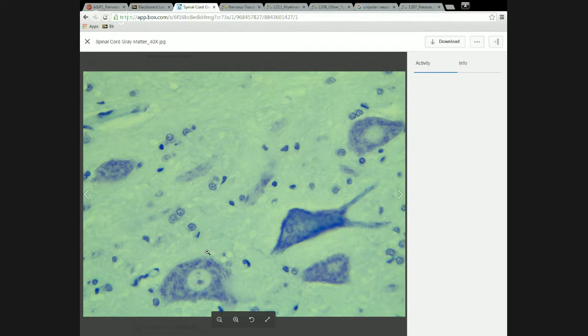Micrometers, 100 or so micrometers in diameter. Nope, that doesn't sound right. It's really small. Let's just leave it at that. I'm getting the words mixed up in my head.